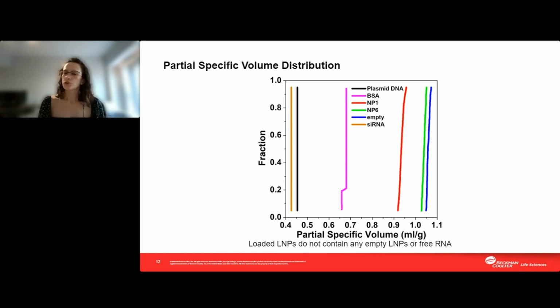And if that is a concern, you can use H218O, which will prevent the hydrogen-deuterium exchange, since the hydrogen doesn't have any deuterium in it, and you're able to get a more accurate partial specific volume. However, for what we were doing, we decided this was not an issue.